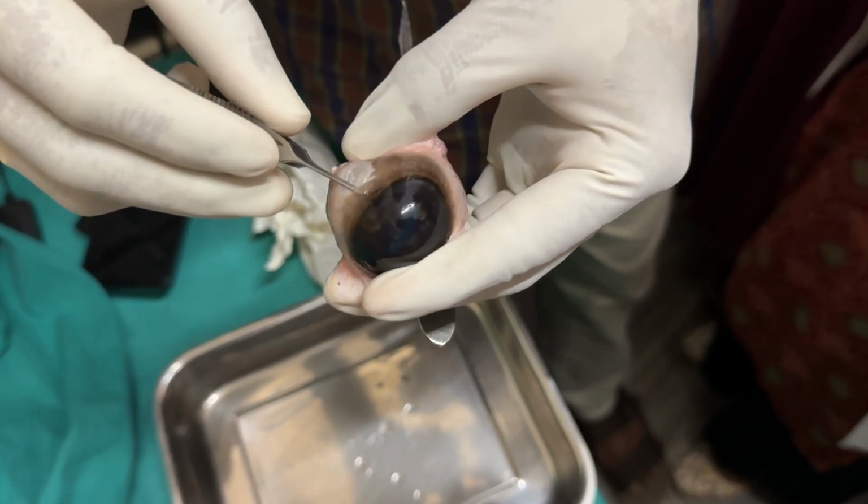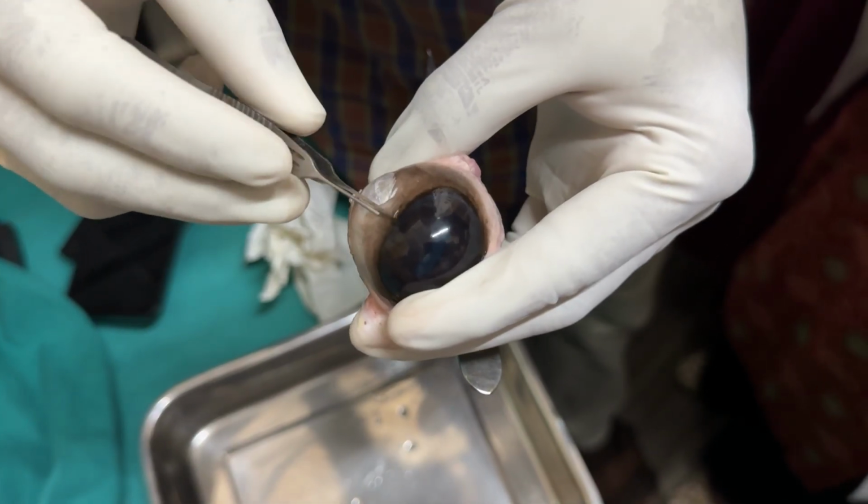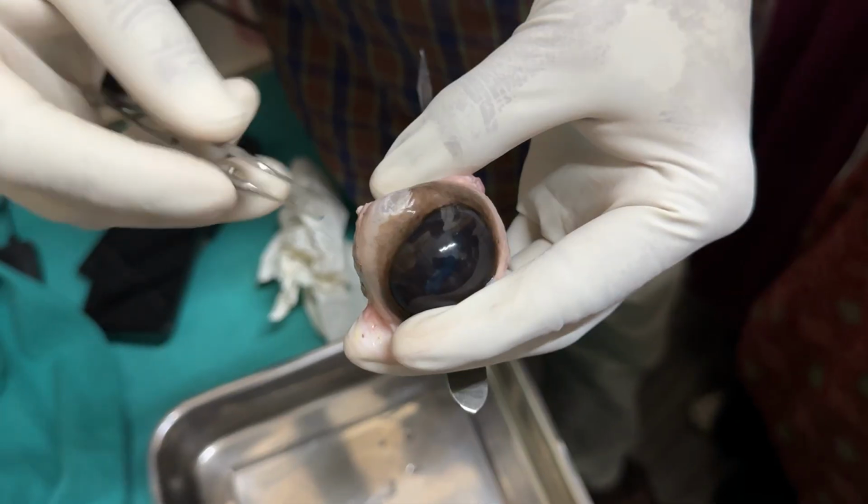You can see that it is going inside. Now we reach the anterior chamber. Our forceps is reaching the anterior chamber.